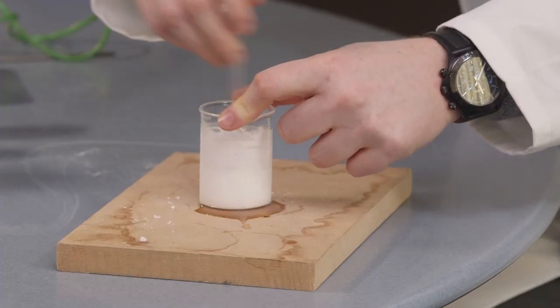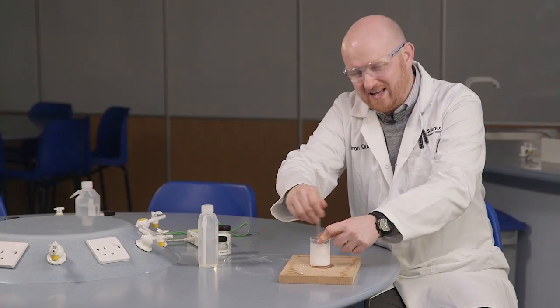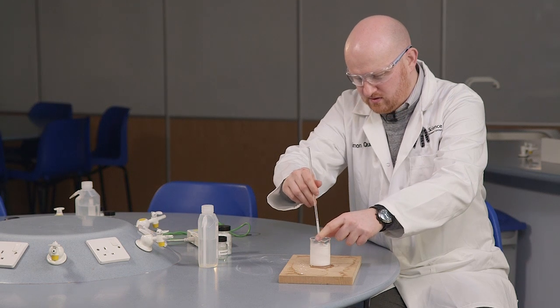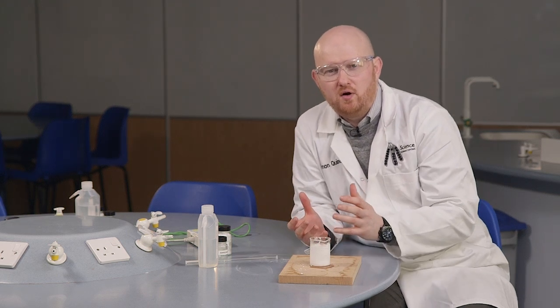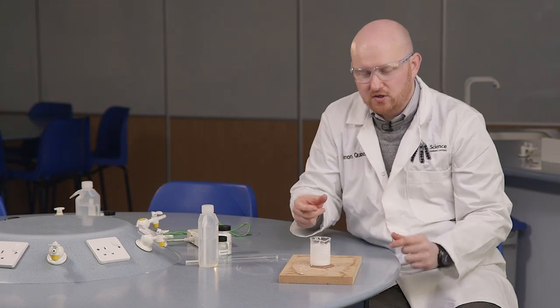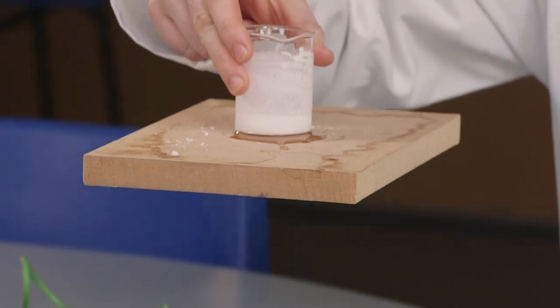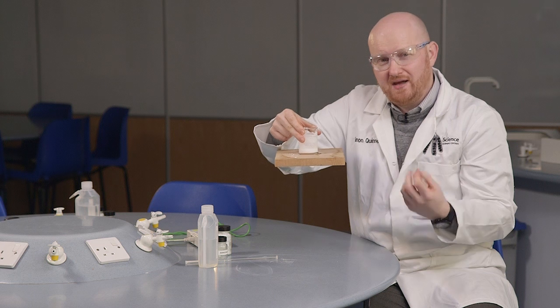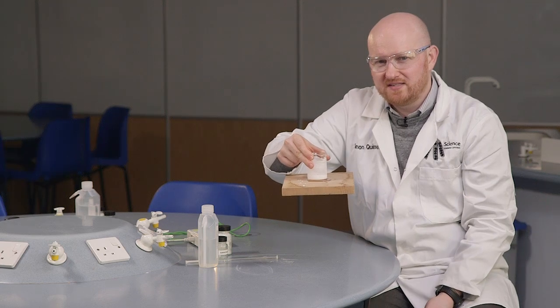So, getting back onto our Christmas lecture, we're getting this really nice and cold, we're getting winter coming. And we should, hopefully, have made it cold enough for that water we put on that block to freeze. And that should have frozen our beaker to our wooden block. So we've got this really, really cold. You can actually see the layer of ice underneath. So we've managed to make this cold enough for ice to form, mimicking winter and mimicking the time for Santa to come to town.